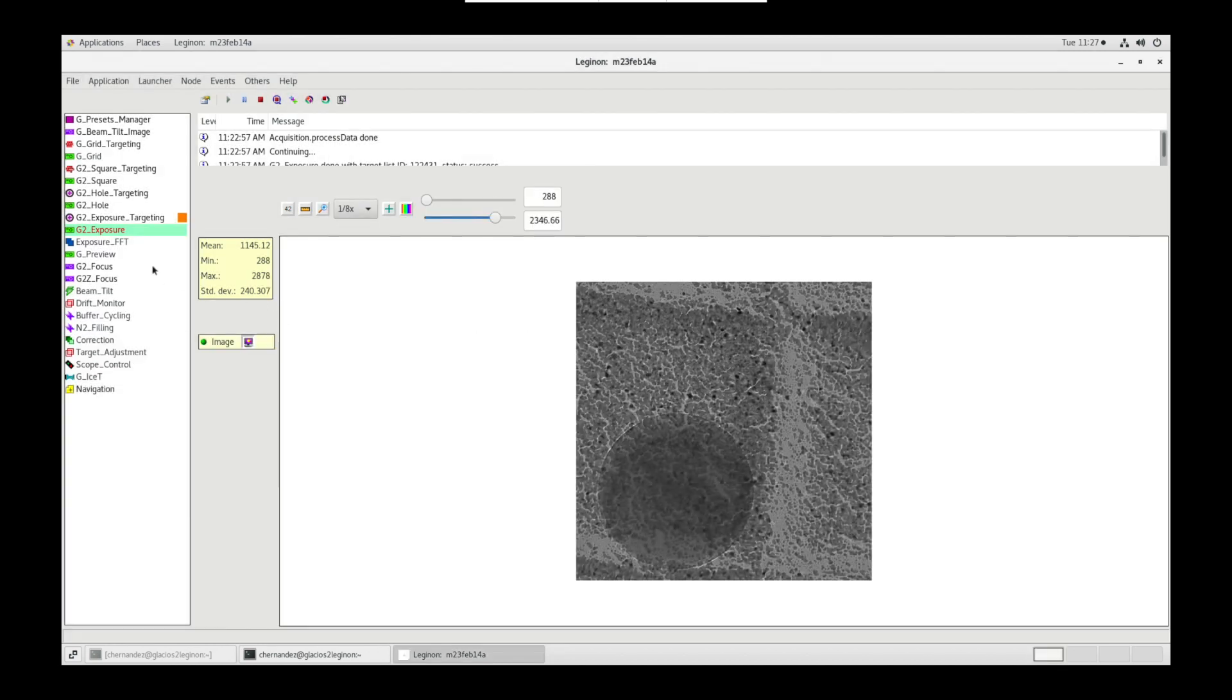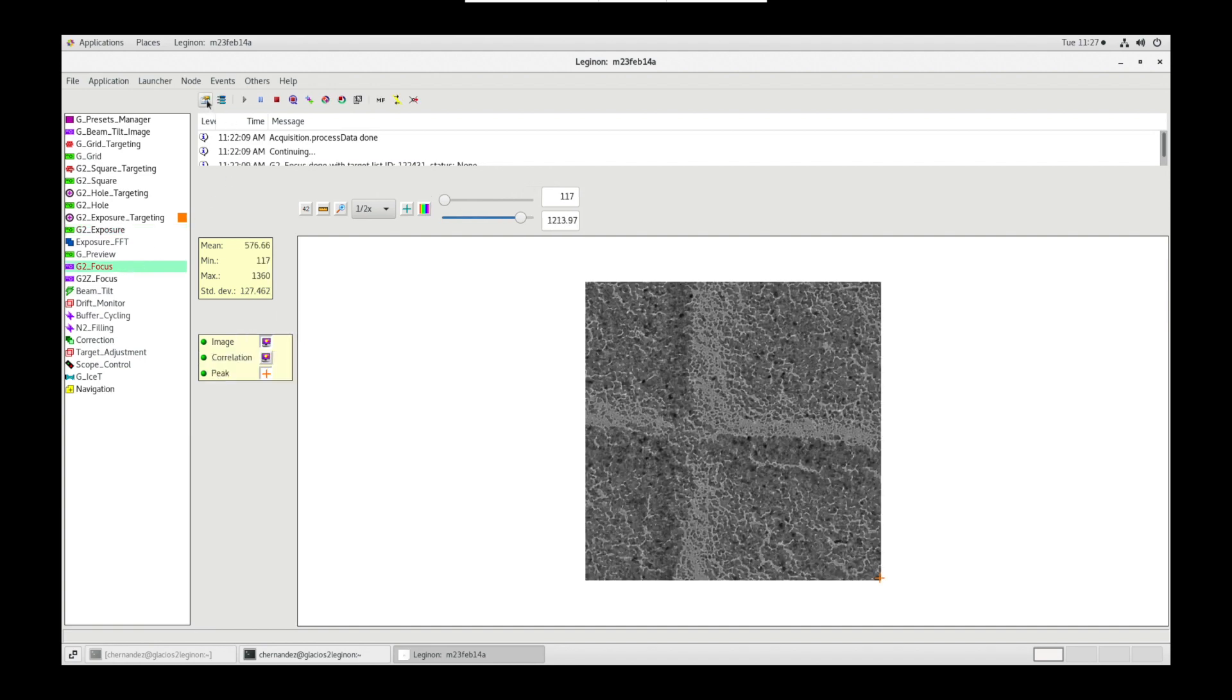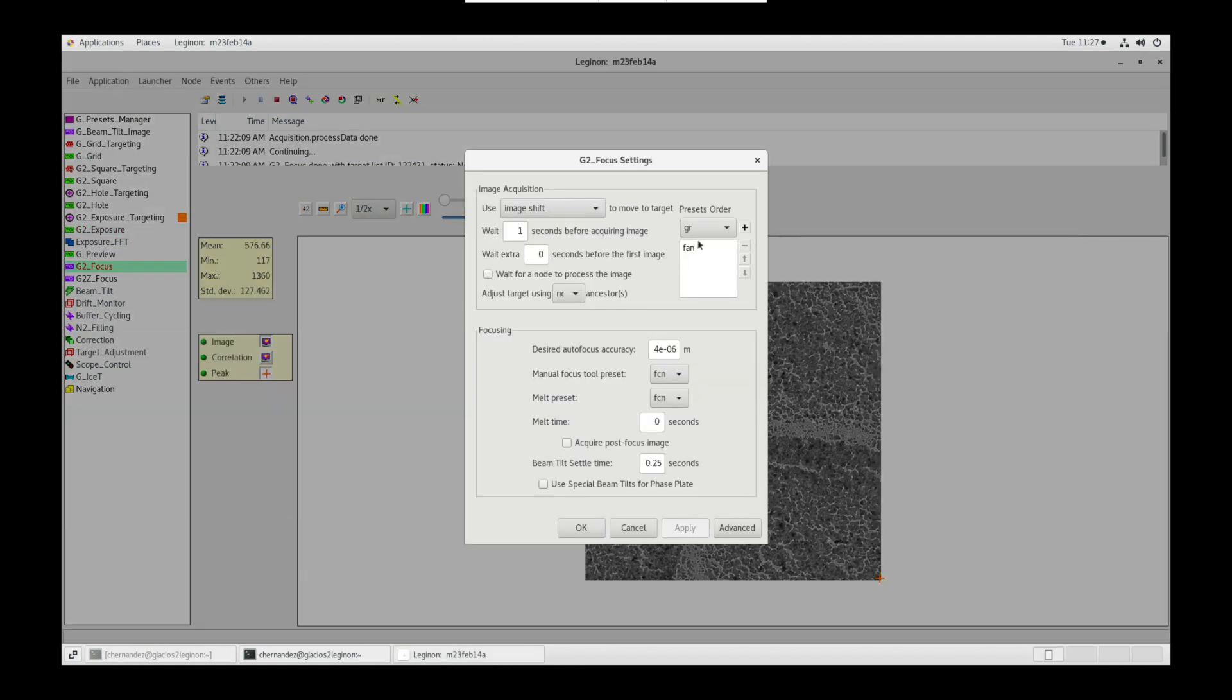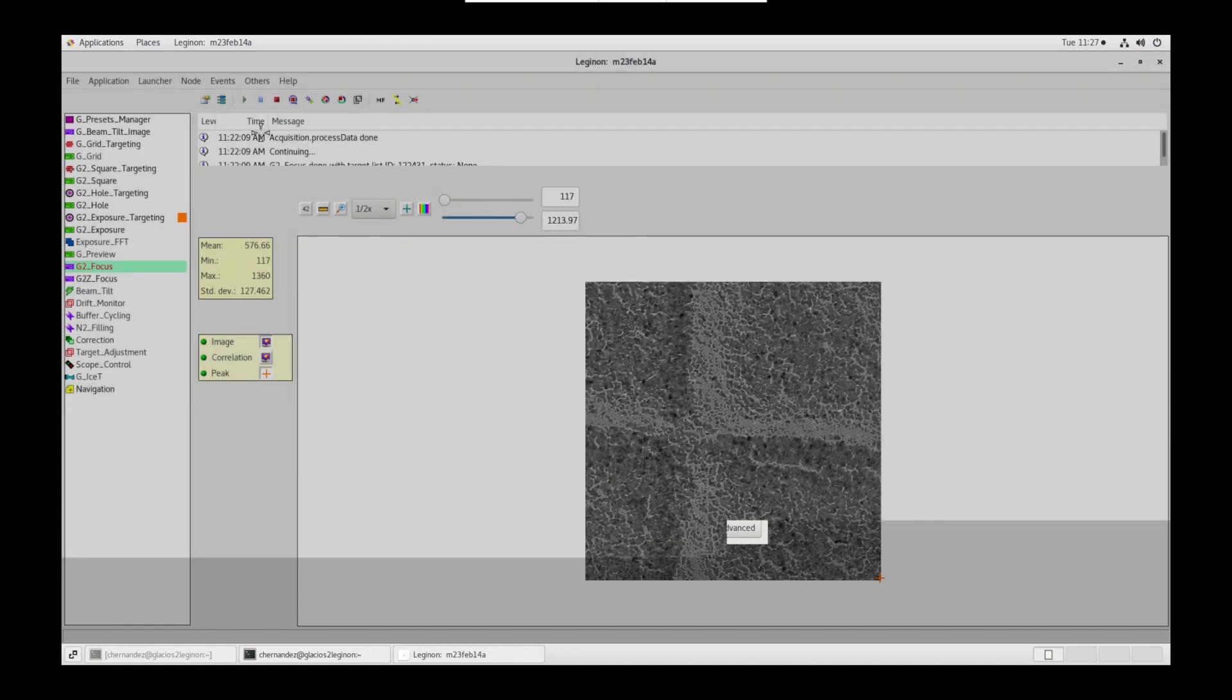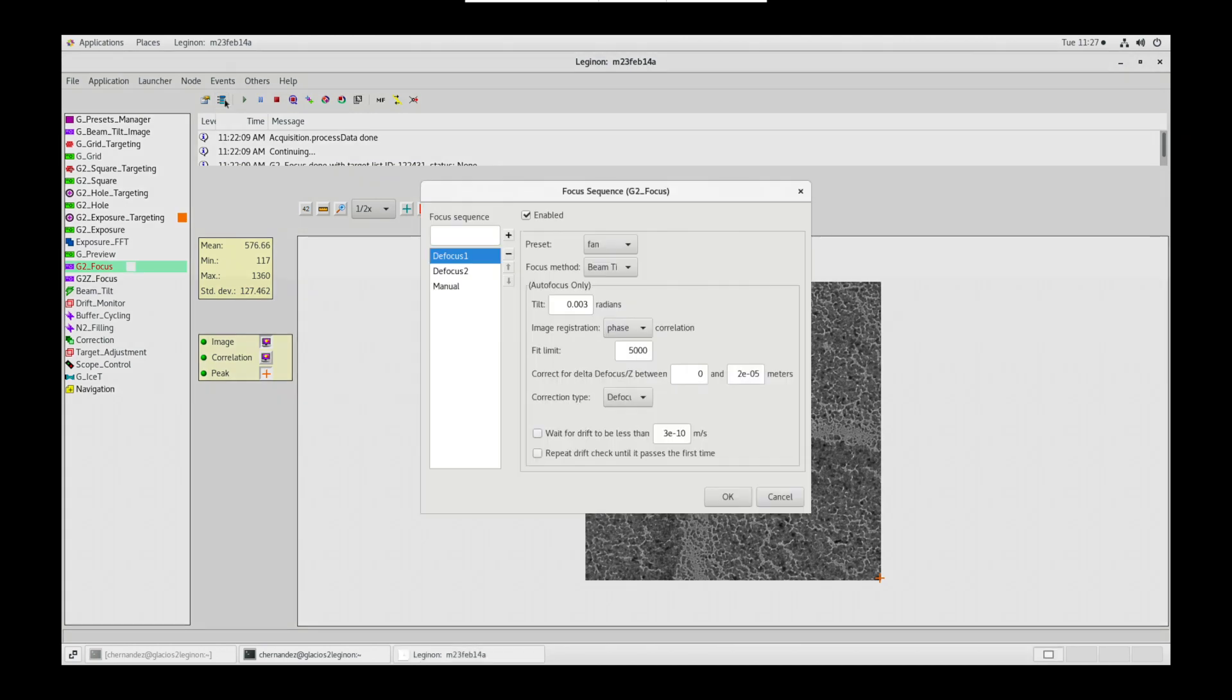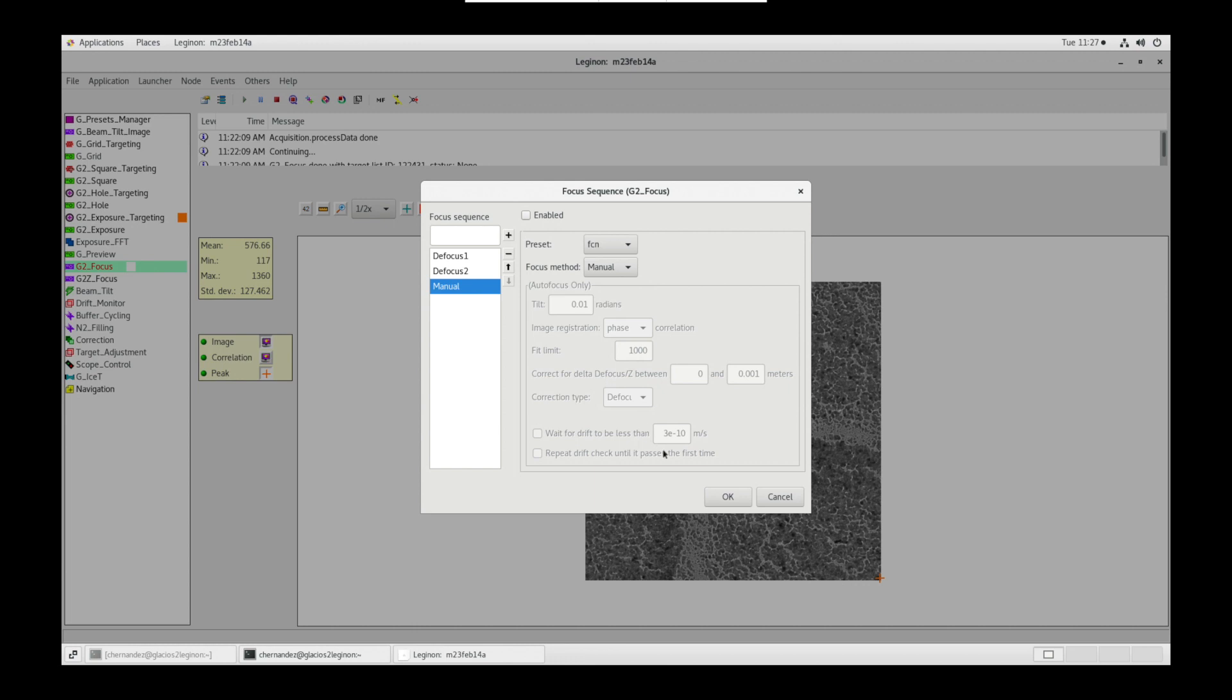Next, let's go into the focus node. In settings, wait for a node to process the image is unchecked. The preset is FAN. And the desired autofocus accuracy is set to 4E to the negative 6 meters. In focus sequence, defocus 1 and 2 presets are FAN. Manual presets is FCN.